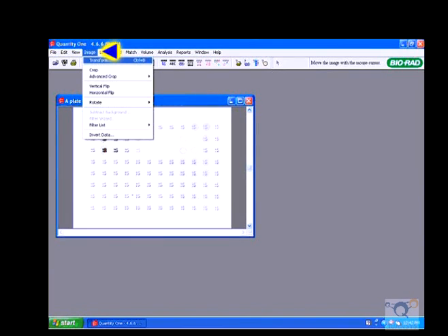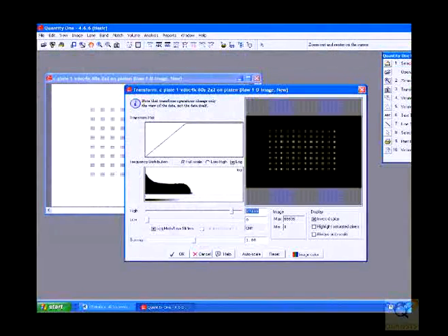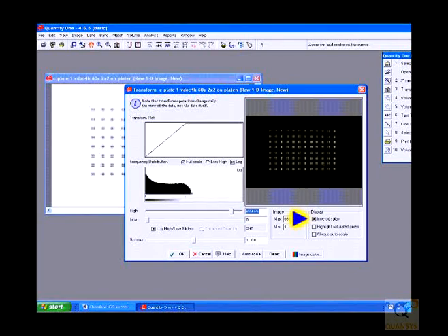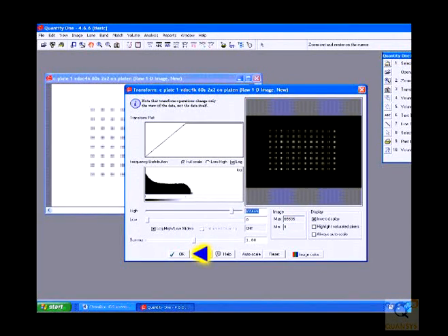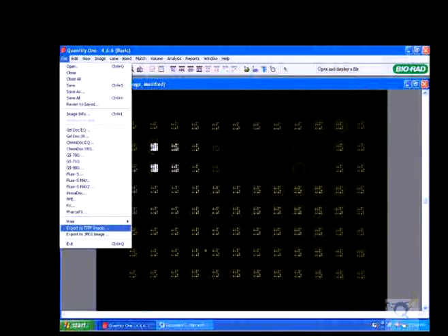To do this, click Image and then a new menu will appear. Select Transform and then check the box that says Invert Display. Click OK and then save the image.